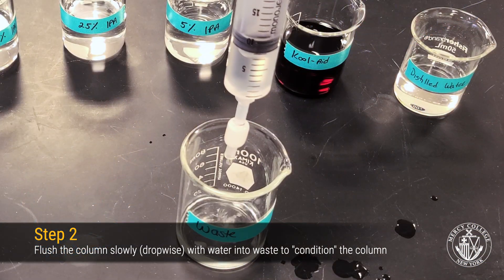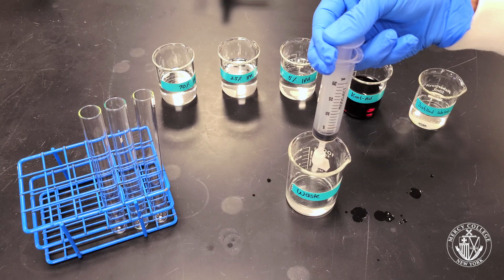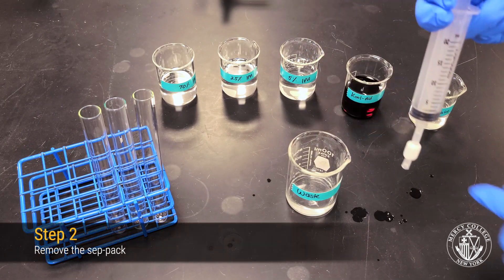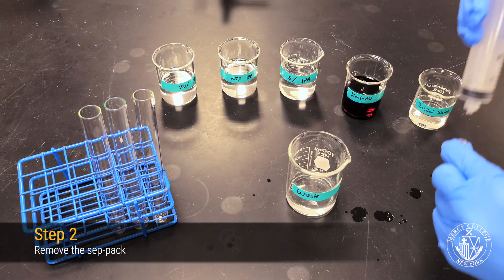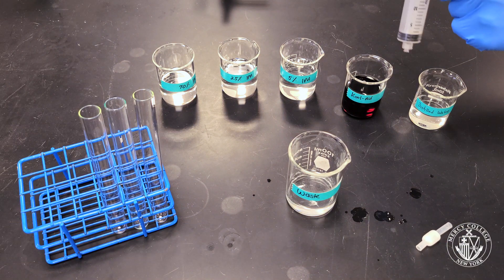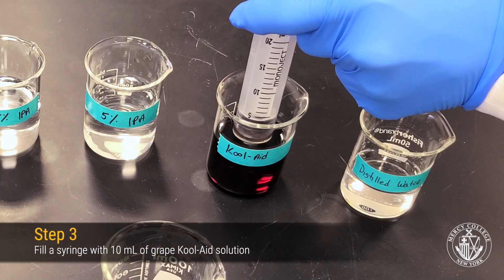Remember to go slowly so that you don't damage the column. Now that you've conditioned your column, remove the CEPPAC cartridge and refill your syringe with 10 mL of your grape Kool-Aid solution.